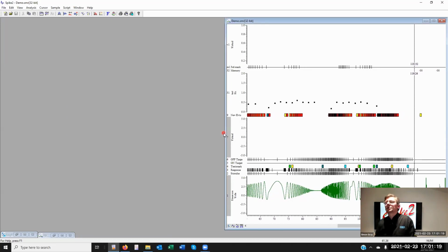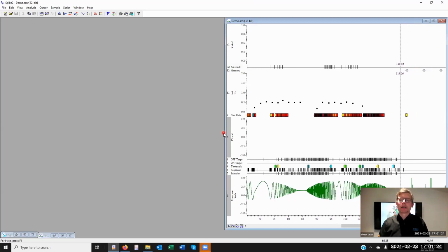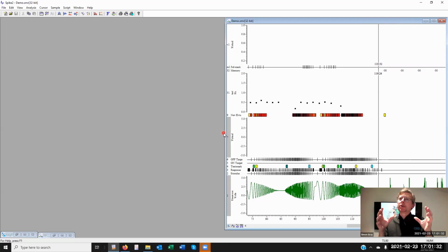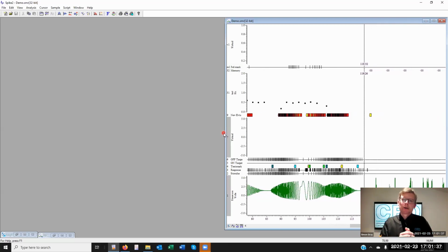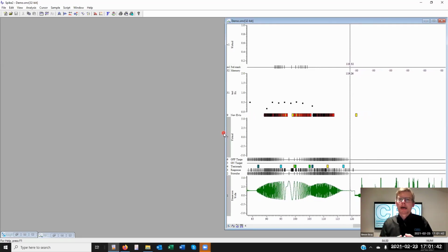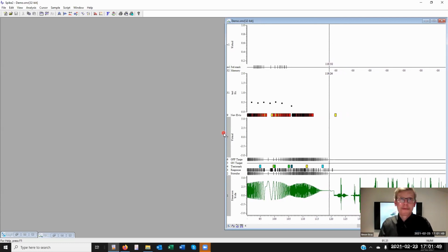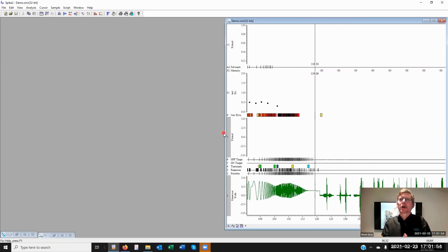This means using a couple of new commands within the script to gather the data, perform the wavelet analysis, and build an image on the clipboard to then paste to the screen. Now, there's an awful lot of data to process often, and we've got 100 million data points that we could put into an array. This is a 2D array, and it's very easy to exceed that. So I'll have to think of a way that I can produce the right sort of output for you.